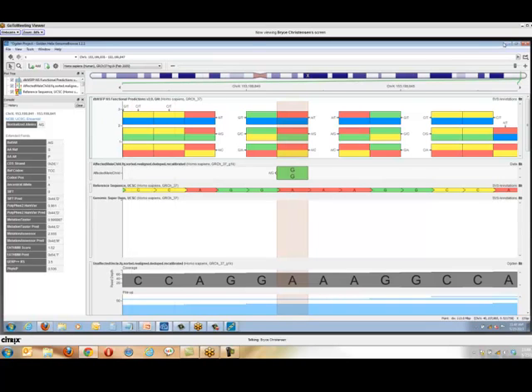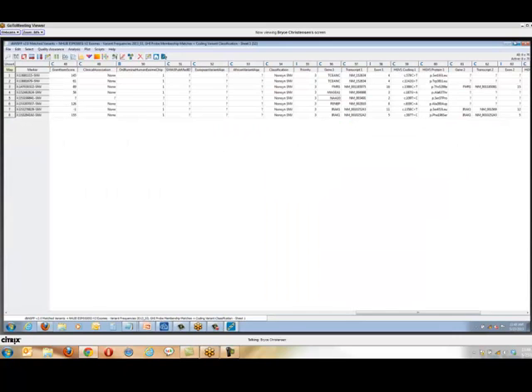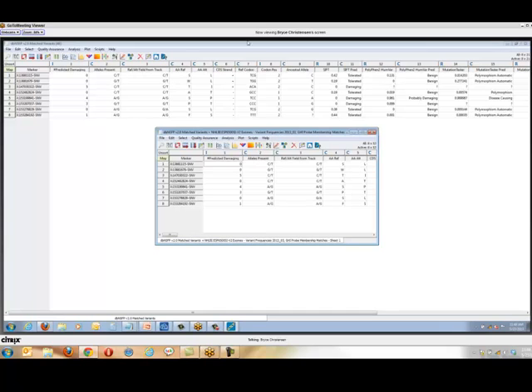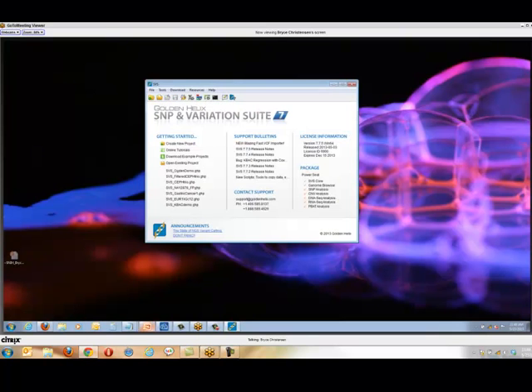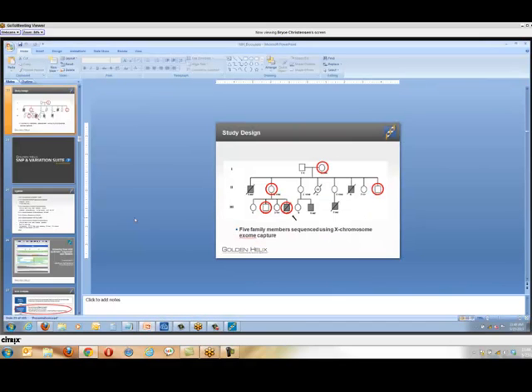Okay, so let's take a minute here. We've seen a good example, but there are a lot of things to be aware of as you are setting up an analysis project. I'm just going to close this project. Cancel out of this and go back to our slides for a minute. Okay.